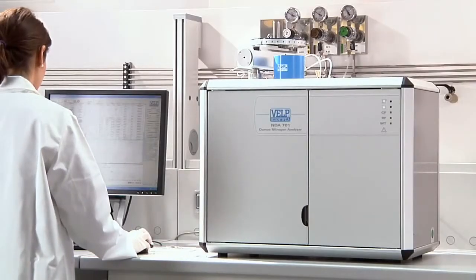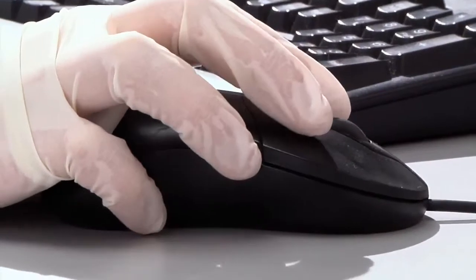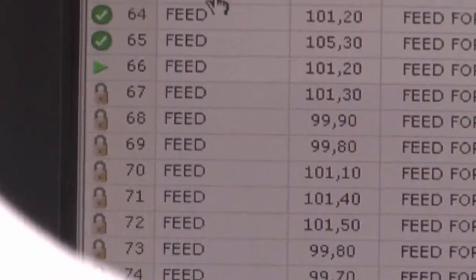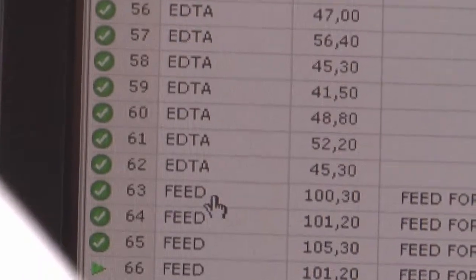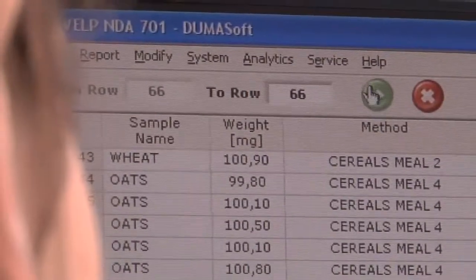Automatically, the sample is purged in a stream of helium, eliminating all traces of atmospheric nitrogen, essential because the NDA701 is able to reach particularly low detection limits.